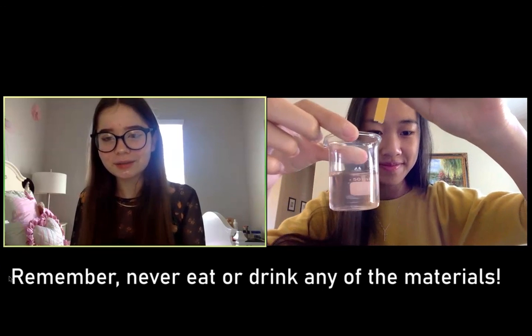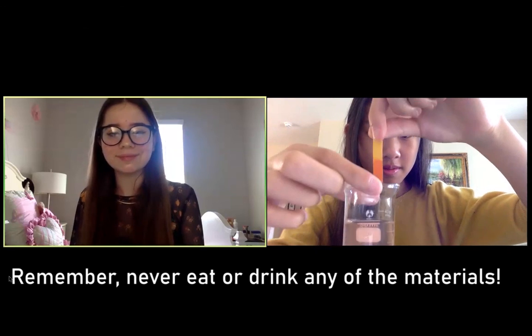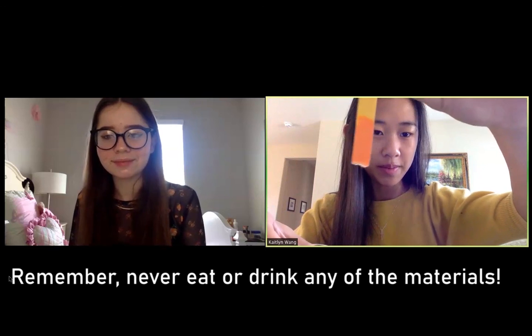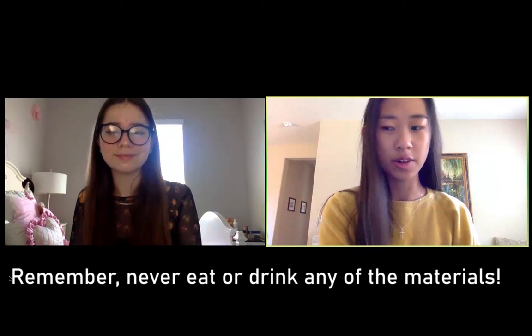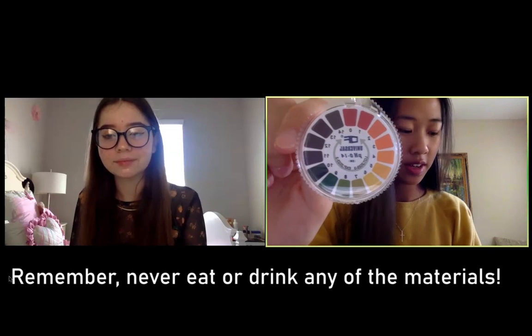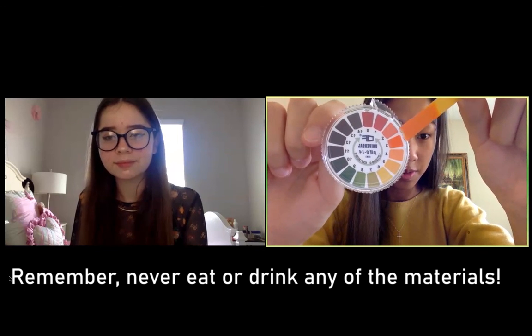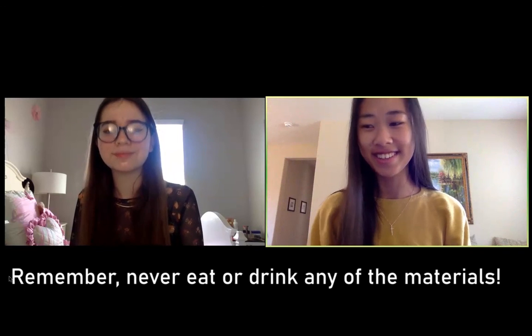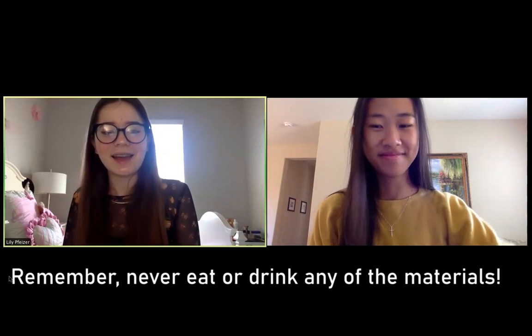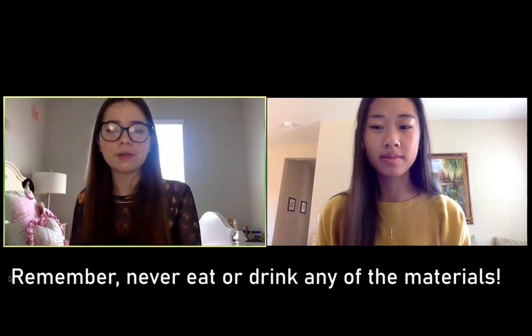Okay, ready? See how it changed color from the yellow of the strip and now it's red? And so according to this scale, if we look at the pH scale, we can match this with a pH of around 2 or 3, which is acidic, as you learned. Exactly.